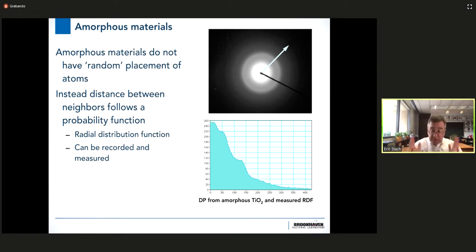So that's another type of pattern that you can see. Now, you haven't learned about this next one in any of the lectures to date because, frankly, it's not really easy to do with X-rays. As I mentioned, the condenser lens can be used to bring down the beam onto the sample in a variety of ways. In the first couple of diffraction patterns I've shown, it's been a parallel beam, right? A single valued incident wave vector that gives you specific angles of Bragg diffraction.